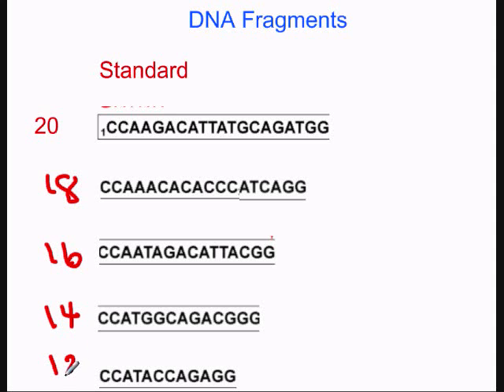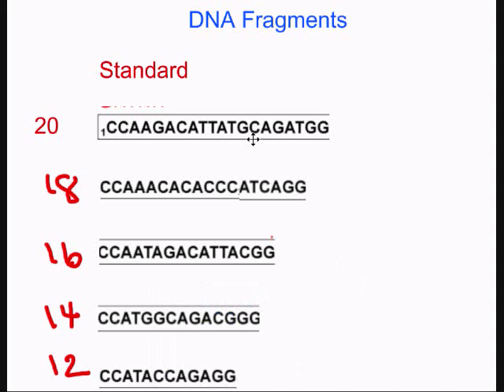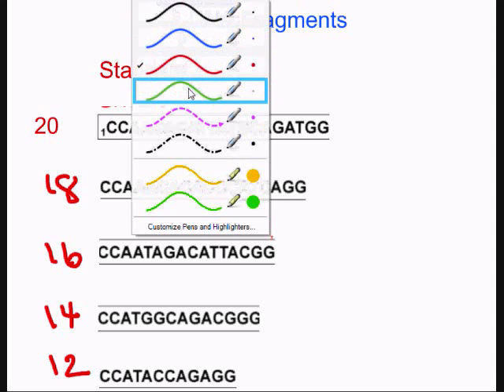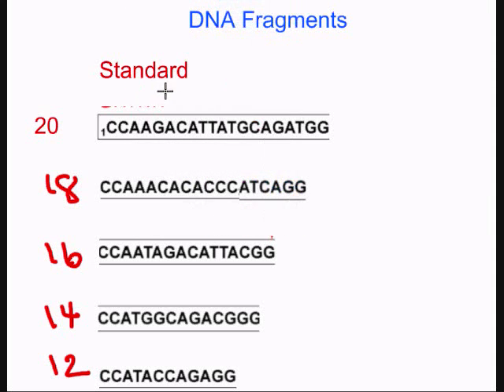Now what you want to do is take that big piece of paper, did we use a 14-inch or a 17-inch? Put it down there landscape style, and take your 8 fragments of the standard, lay them out in order of size, give yourself a little space in between them there, and then tape them down. And you can just take one piece of tape and tape the whole thing down. So if I just had one long piece of tape, right, I might be able to just tape it down like this, and they would all stay there. But give yourself some room.